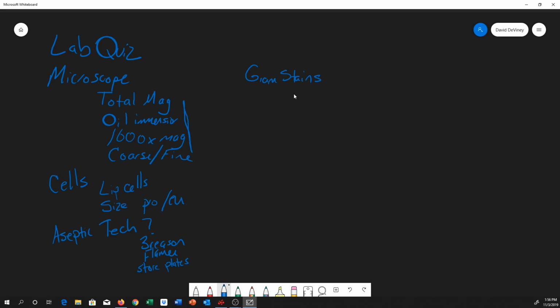you started with the crystal violet, then you washed with water, then the iodine, washed with water, destained or decolorized with alcohol, rinsed with water, and then safranin. You don't have to know times for those, but you need to know the orders of each one.